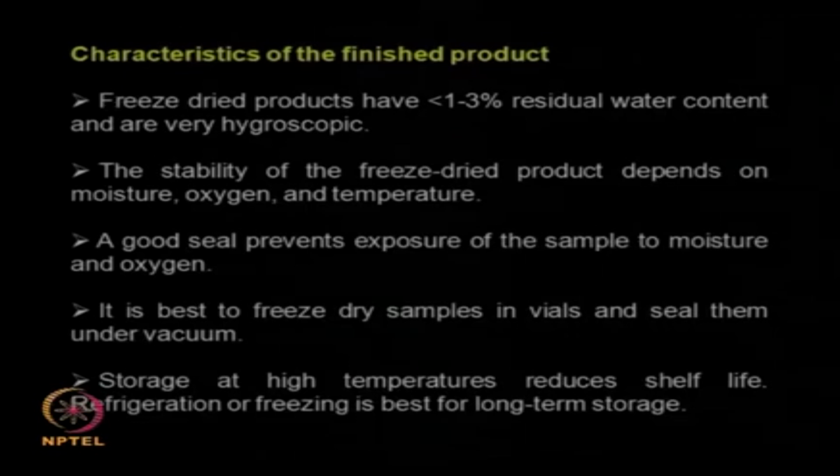So what are the characteristics of the finished products? Once I have done some lyophilization, the amount of residual water present may be in the order of 1 to 3%. So the stability of the freeze dried products depends on the moisture present, oxygen, temperature. But if you are freeze drying vials and you have a good sealing system, you are preventing exposure to moisture and oxygen. So it is ideal to do small samples in vials, so we can seal them under vacuum.